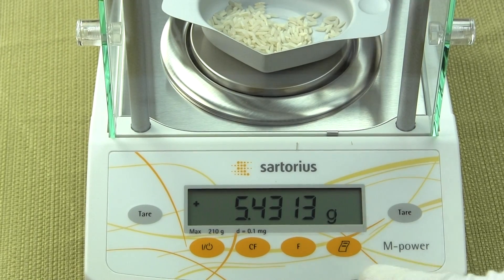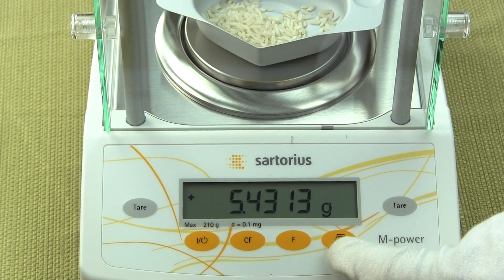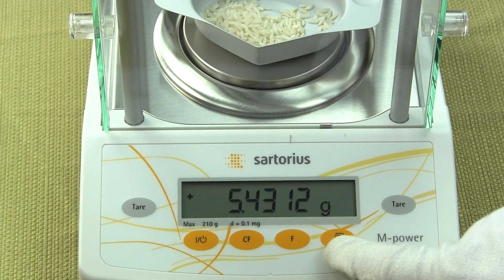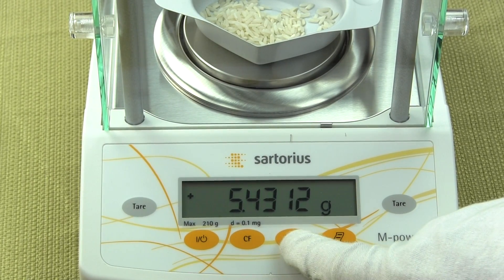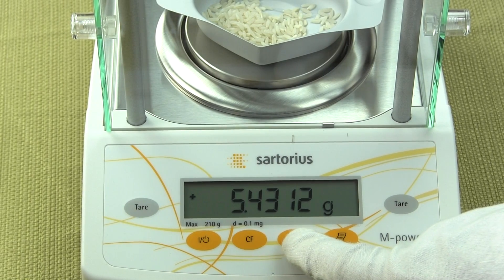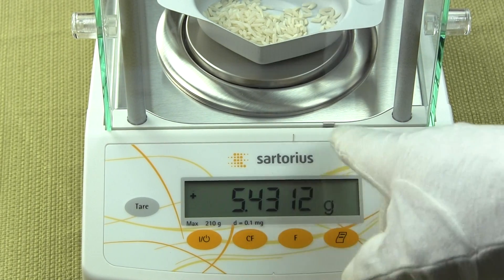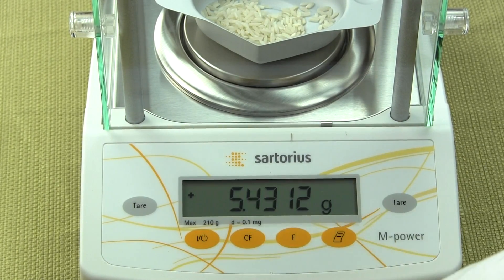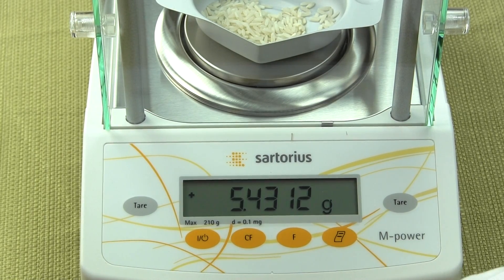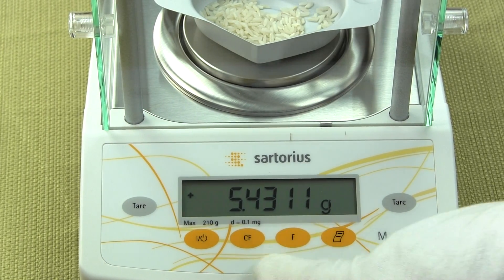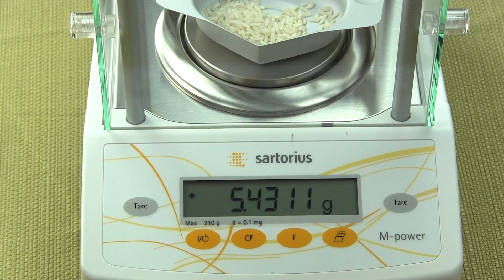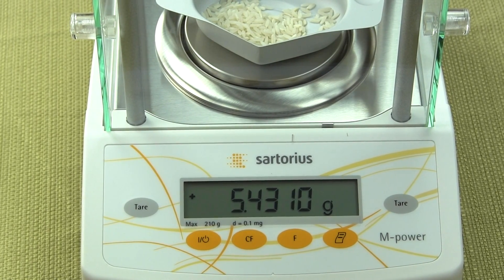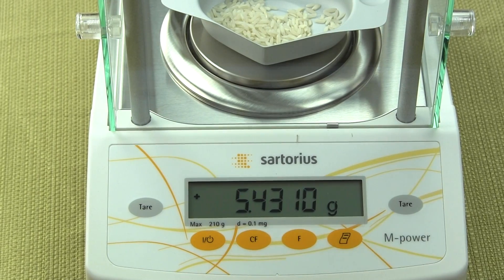You do have here on the right hand side the print key. If you were to purchase the balance with an optional printer, the F key is the function key. If you set this balance up for multiple weigh modes, you would just press the F key and it would switch. The default of this balance from the factory is grams only. And the CF is just the clear function altogether. If you're in a function like parts counting mode, the CF would clear that for you.